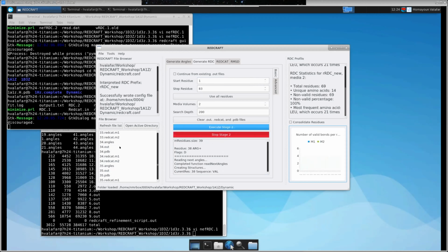You can say anecdotally, you kind of need to have 15-ish NOEs per residue to be successful. But for regions where you have less than 15, the implication is that ambiguity in structure calculation will become uncertain. If you drop for some residue from 15 to 10, what is the impact of that on the quality of your structure? And if your structure is then poorly defined there, is it going to be mistaken for dynamics? The issue just gets clouded.